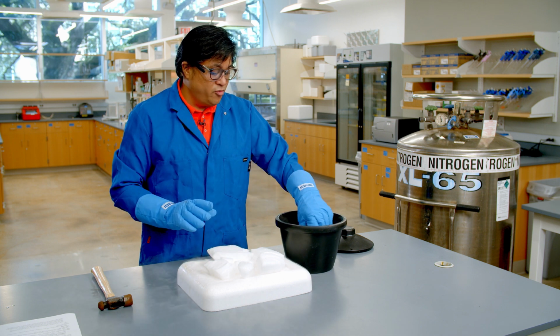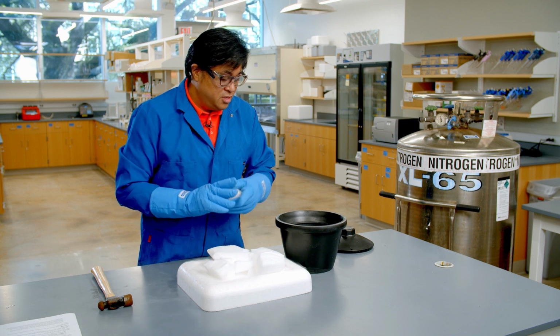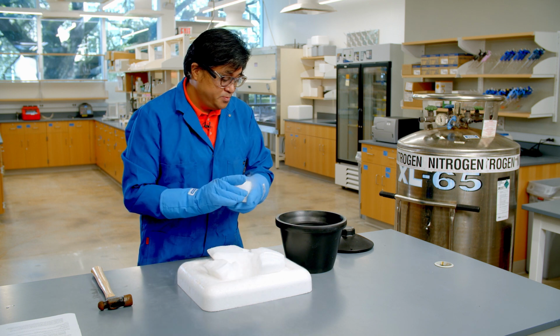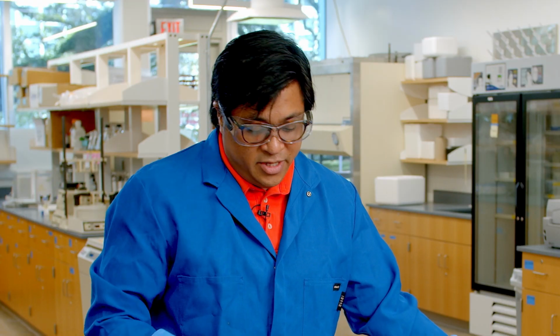You should never store dry ice in a sealed container. Doing so will cause overpressurization and will lead to an explosion. Never handle dry ice in a confined area. Since dry ice will sublimate into carbon dioxide, you want to make sure you work in a well-ventilated space or in a laboratory. And remember, never handle dry ice with your bare hands.